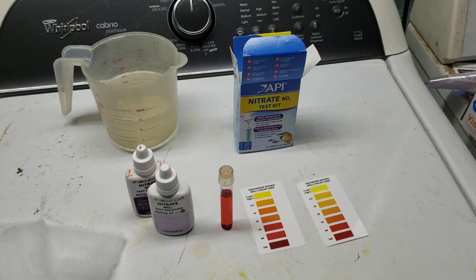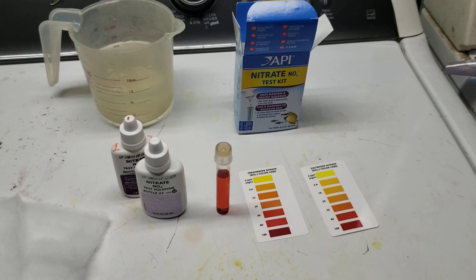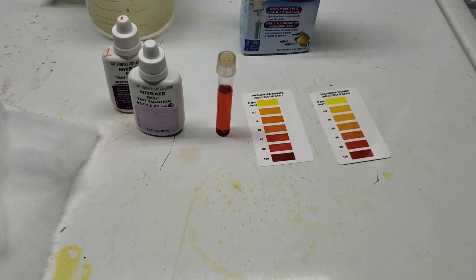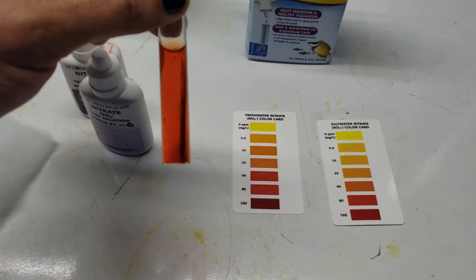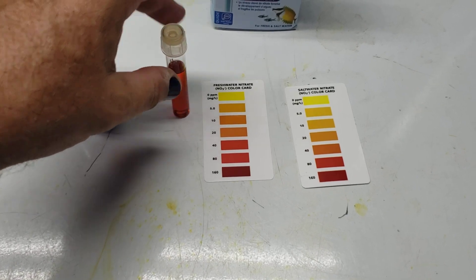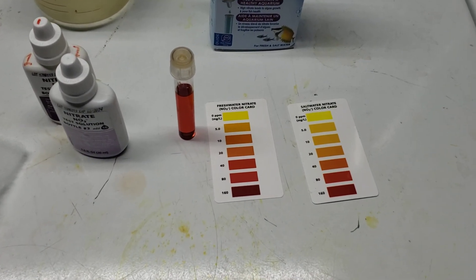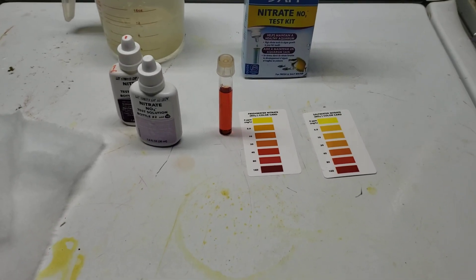Hey everybody, I'm doing a water change on my 125 and I thought I would check the nitrates just to get an idea of what's going on in the tank. And I thought this would be a good opportunity to discuss something that comes up a lot — the level of precision with which we can judge the nitrates in our tank with these API test kits. They're just not very precise, if for no other reason it's incredibly difficult to tell exactly what color that is.